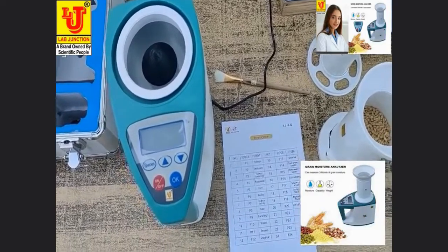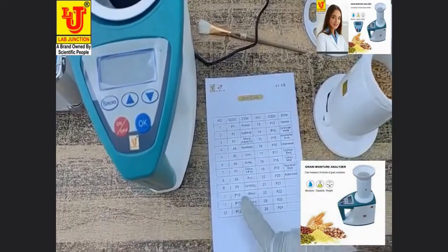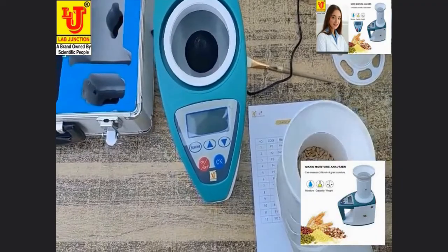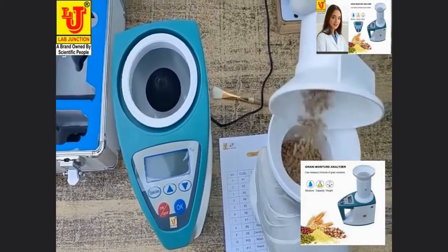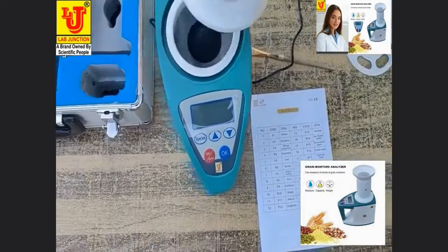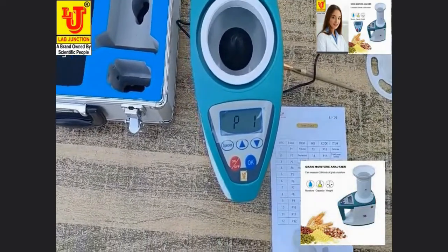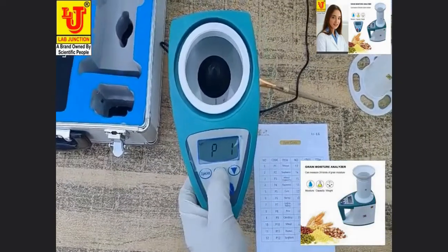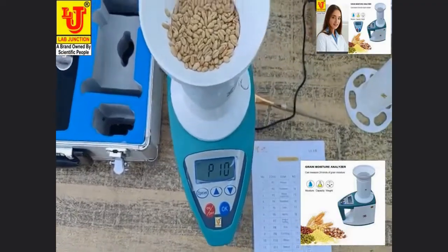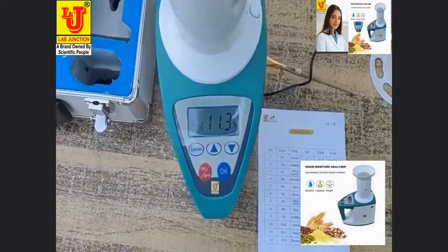Now I am measuring wheat moisture. Wheat item code is P10. Switching on the machine, selecting code for wheat P10, then press this key. Directly, moisture reading for wheat: 11.3%.